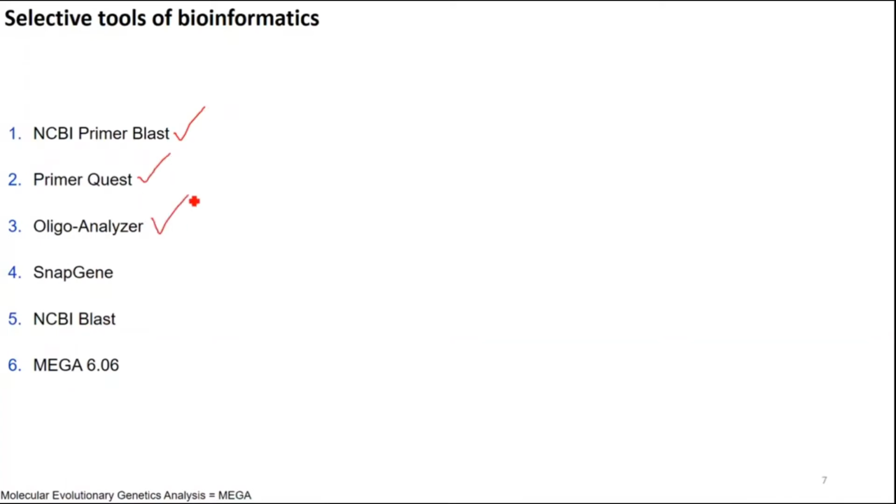and the OligoAnalyzer. And we will also see one new software, SnapGene, that I utilized throughout my career, and it is very beneficial. Though it is a paid one, its free version is also available that gives some limited facilities.